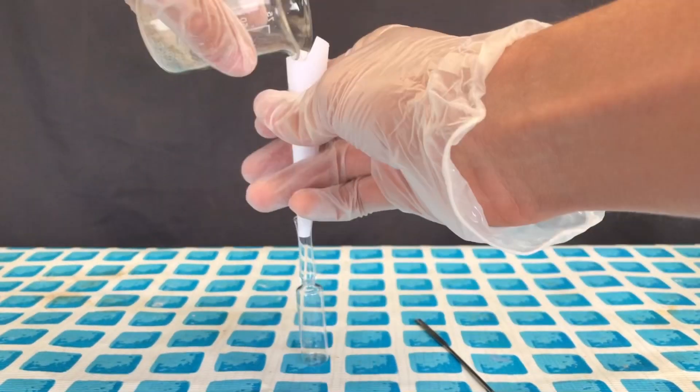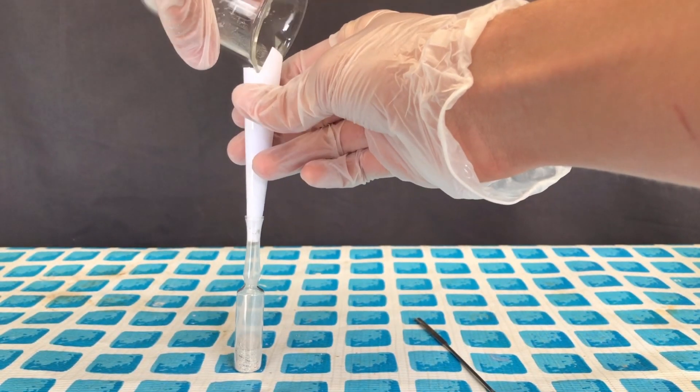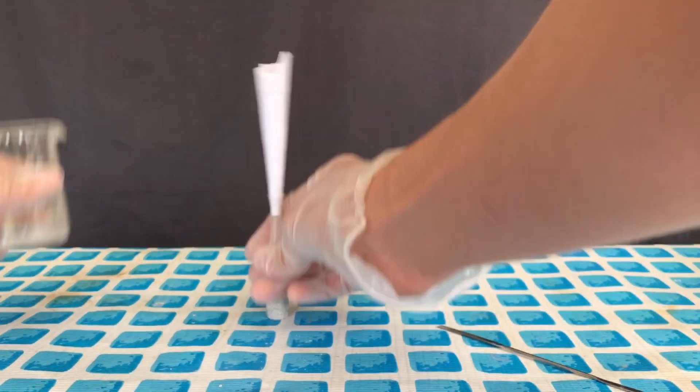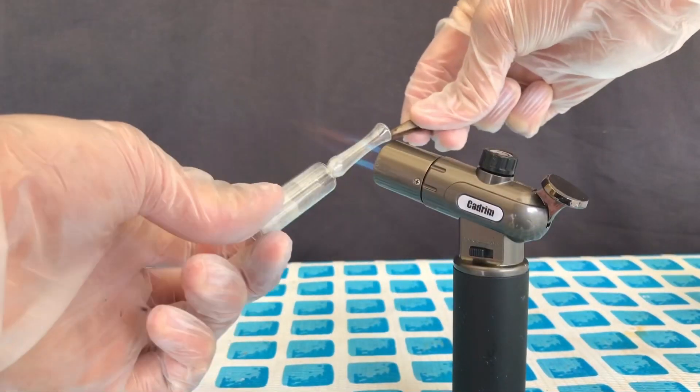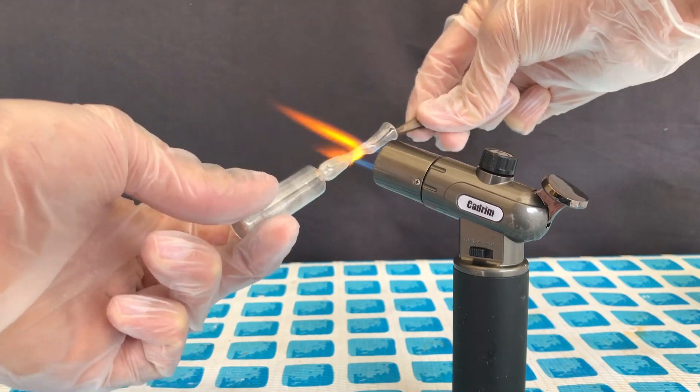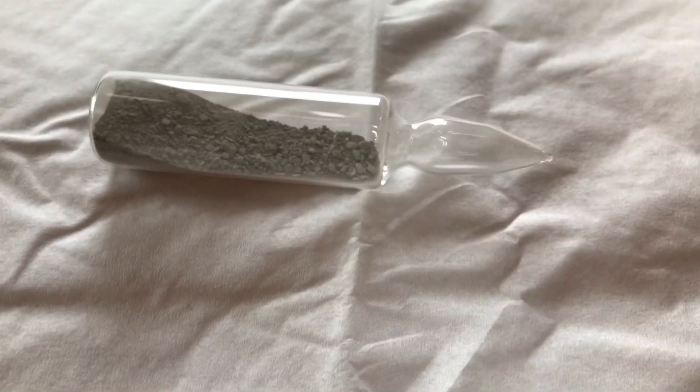The product unfortunately still contains some of the oxide we started with and this is probably because we used too little calcium. Using more calcium or using some flux like calcium chloride could increase the yield.